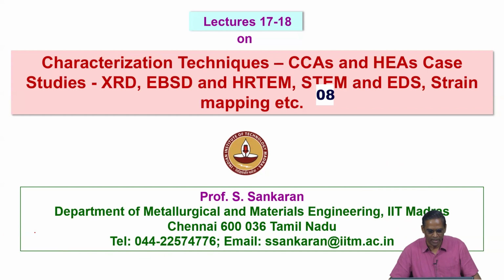Okay, good morning again, and we will start our lecture on characterization techniques on CCA alloys as well as high entropy alloys. What I will do in this lecture, I will demonstrate some case studies. We will start with some case studies which involve different characterization techniques like X-ray diffraction, EBSD and HRTEM, STEM and EDS, strain mapping, etc. If the time permits, we will concentrate on strain mapping, otherwise we will postpone it to the next lecture.